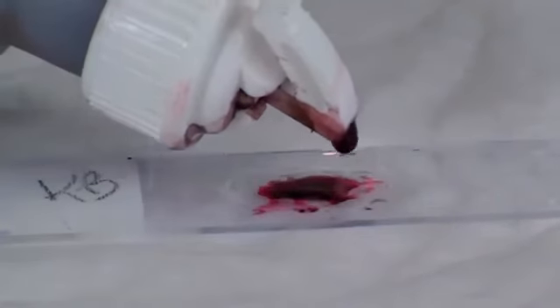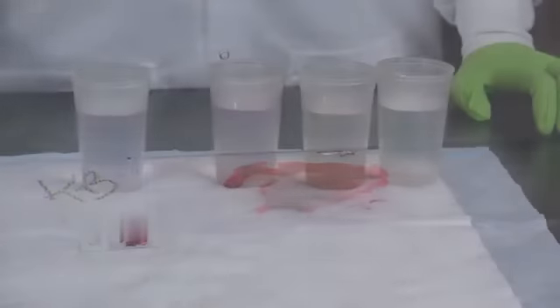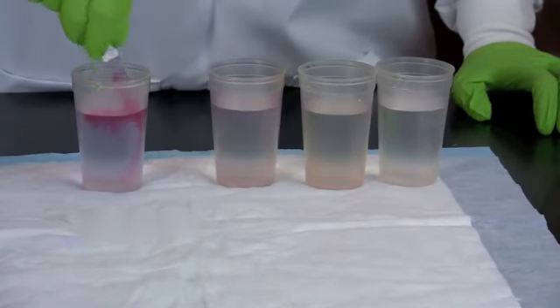Counterstain by adding safranin stain to cover the bacteria and let it stand for 1 minute. After 1 minute, completely rinse the slide in water.